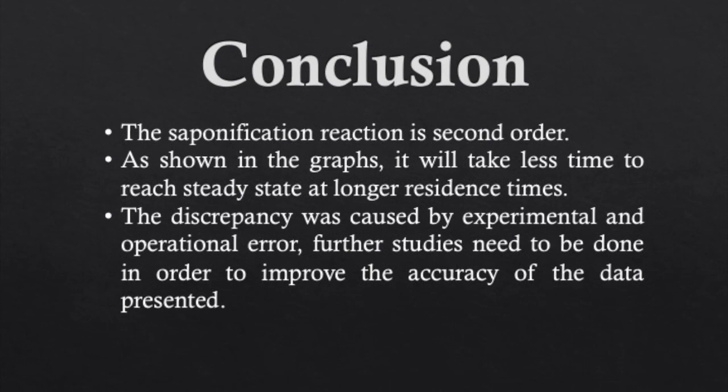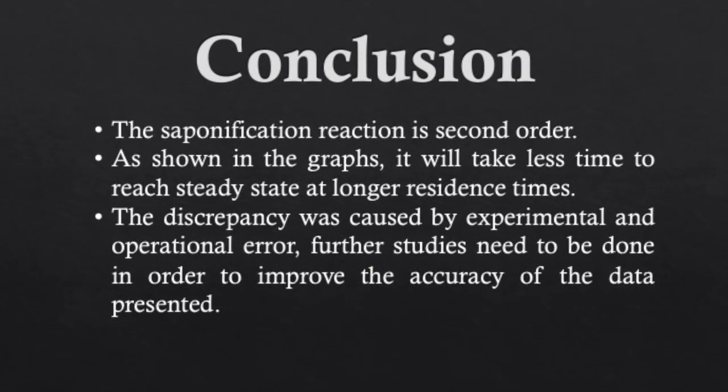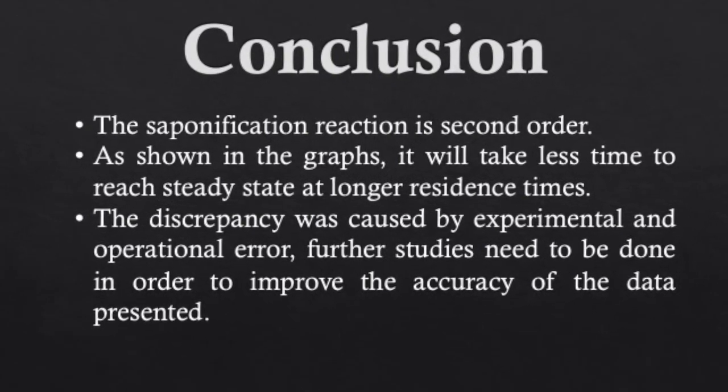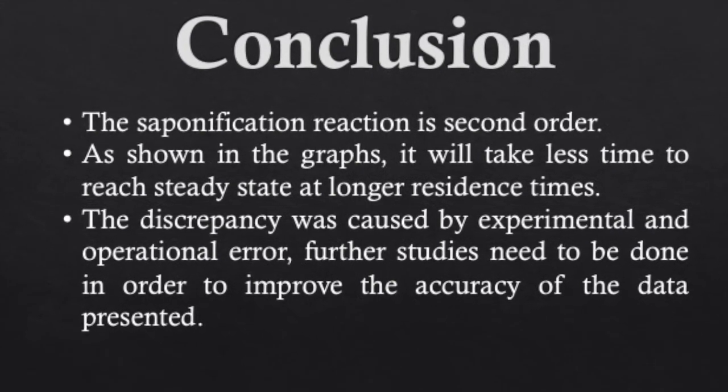Conclusion. We can conclude that the saponification reaction is second order. As shown in the graphs, it will take less time to reach steady state at longer residence times. The discrepancy was caused by experimental and operational error. Further studies need to be done in order to improve the accuracy of the data presented.